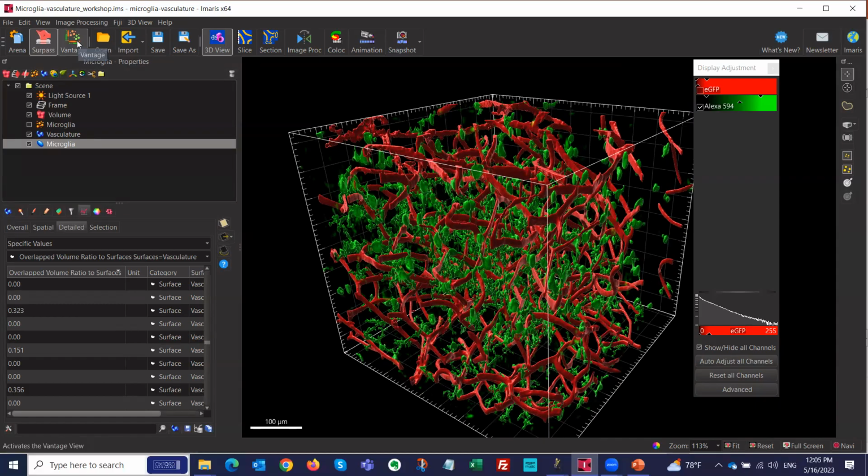Oh, yeah, that's a question. The diffusion gradient? So there is no way to define it directly because it's not like a CFD software.